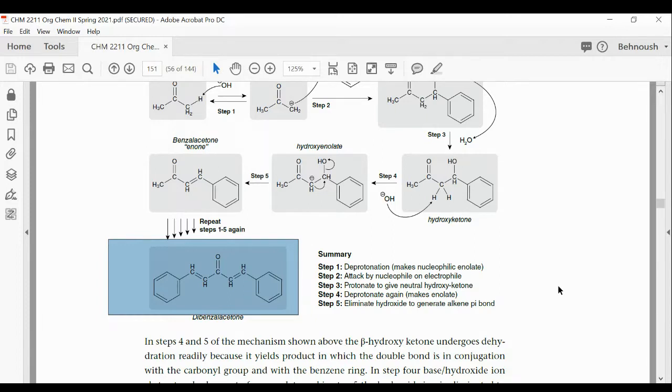If it's not close to that number and you have a wide range of melting, that means the compound is not pure. The greater the percent impurity, the lower the melting point is going to be. So if you get a number like 109, 108, then we consider it pure enough. But if you get a number like 99 or 100 or 102, that would be an impure sample.